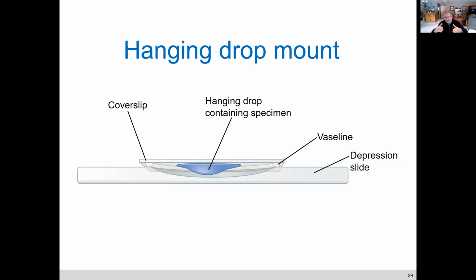And what you basically do is you take a cover slip, you put a drop of suspension, let's say it's pond water. You put the drop on your cover slip. That's that little plastic square that you've perhaps seen in the bio lab. Okay, so just kind of picture what I'm describing. A drop on top of the cover slip. You take some Vaseline and using a toothpick, you apply that around the periphery of your cover slip. Usually you go at the corners.